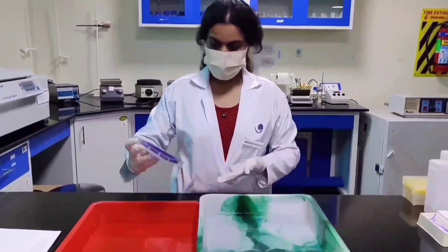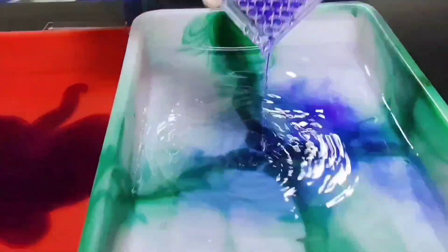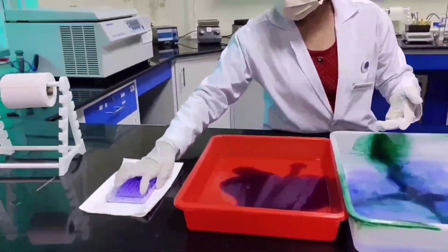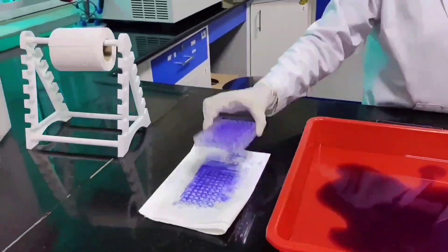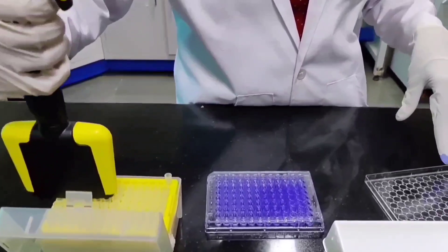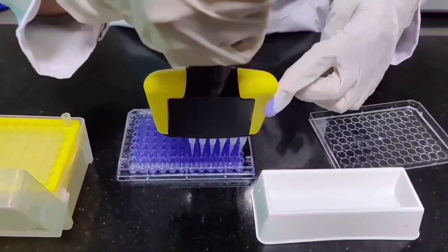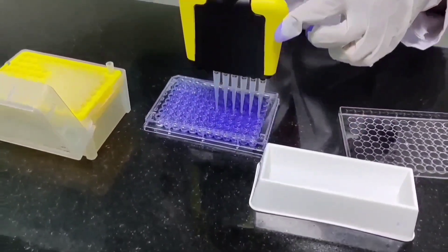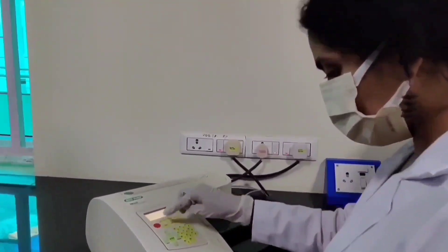The plate is then rinsed in water and air dried for 20 to 30 minutes. Finally, the plate is read at 595 nanometers.